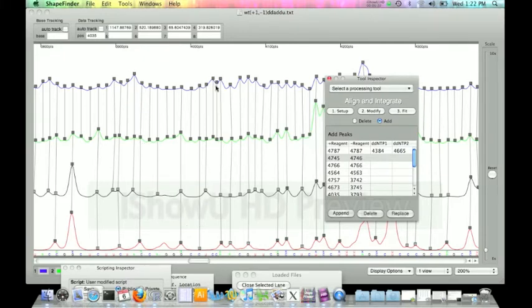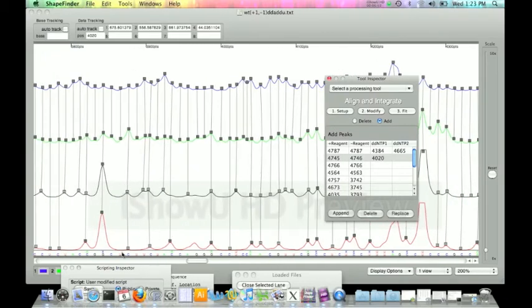So you see here, now that we added this peak in here, we have our U peak lining up, no problem. We've shifted over to the right. And go ahead and click on this little guy right here. There we go. Now we have our U. As you can see, we have another shift going on right here. We have a U off by 1 of these U's, 2 U's. So we're seeing there's a shift of 1 position here, and the shift also occurs here, and it's also in here. So I'd say somewhere between this spot and this spot, we need to add a peak. It looks like there's some unequal spacing right here. I'm going to go ahead and just click on that, add that peak in there, and boom, look, our data lines up perfectly. We've got our U's lining up with our U's.